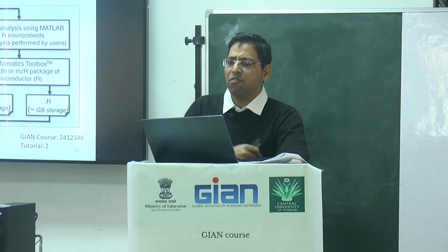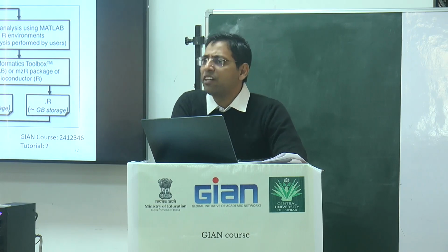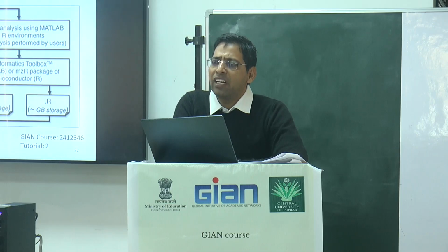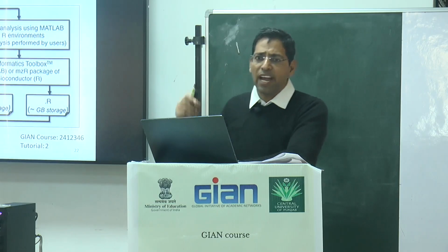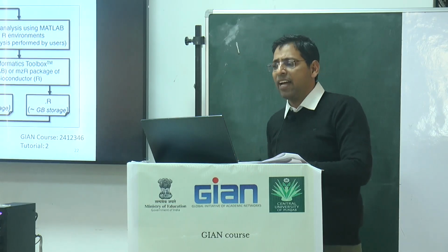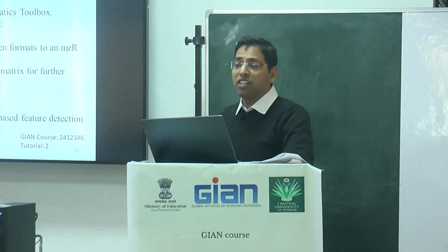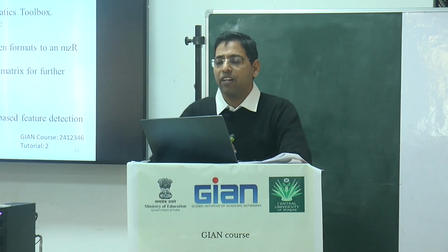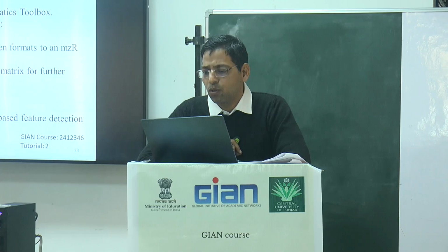Another step is the feature detection package. You have to use some software present in a pipeline to extract the unique features among the different variations so that you can capture them and use them as a reference to differentiate one set of samples from another set of samples. So XCMS, MetAlign, MarkerLynx, as well as MZmine. These are the few software packages we have to use for the feature extraction protocol basically.